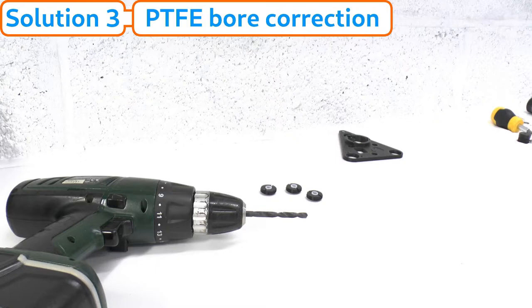If both manual manipulation and greasing don't solve the problem, proceed to the next solution: drilling the PTFE boreholes. This is the most drastic solution, akin to a surgical procedure which, as for all surgery, should only be attempted if the previous less invasive options have failed. It must also be done with great care to avoid complications.